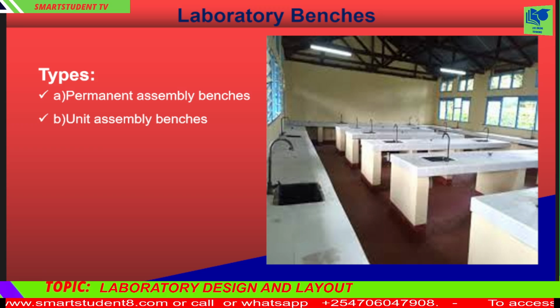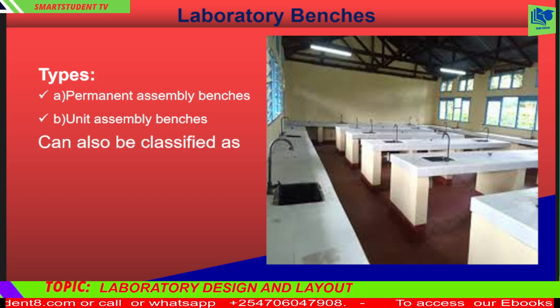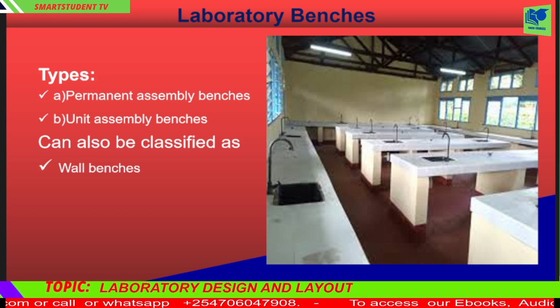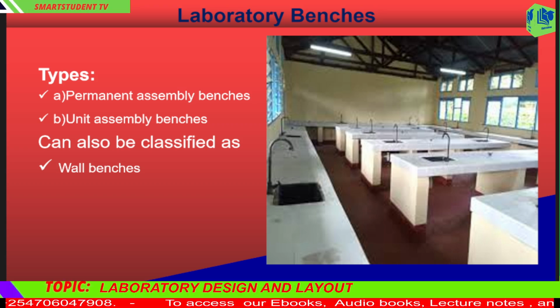Laboratory benches can also be classified into the following three categories based on the positioning in the lab. A. Wall benches. They run along the side walls of the laboratory. Heavy equipment, water taps, and gas taps are usually placed on these benches.